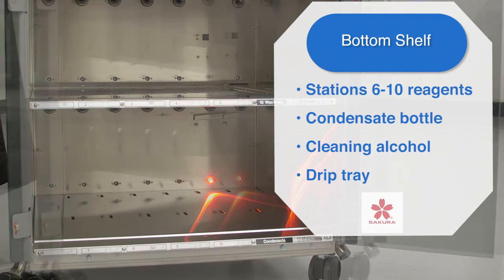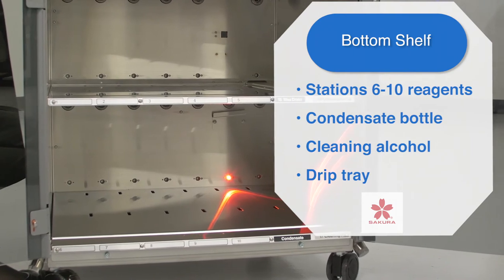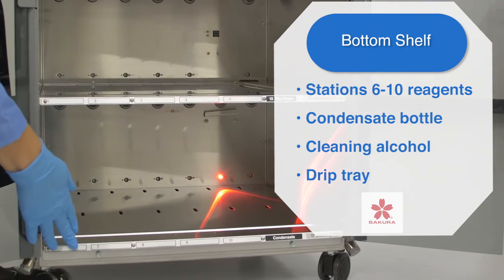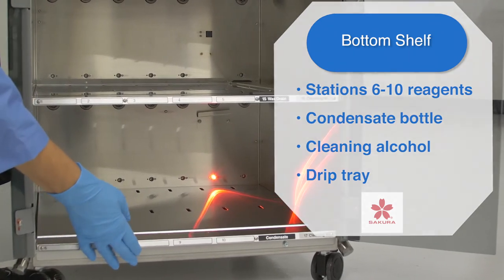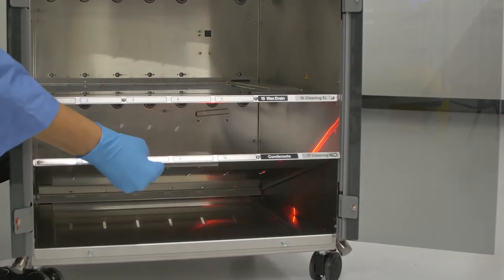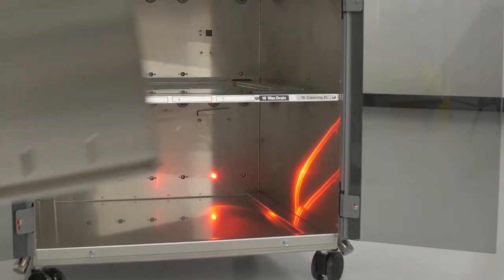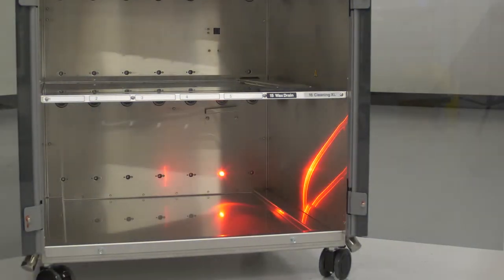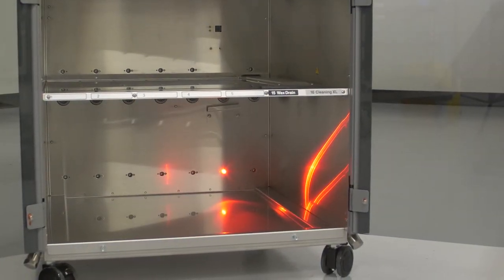The bottom shelf also contains the condensate bottle and cleaning alcohol station. There is also a drip tray below the bottom shelf. To access the drip tray, the bottom tray must be lifted. This drip tray has the capacity to hold up to 2.7 liters of reagent. It should be checked periodically and cleaned.